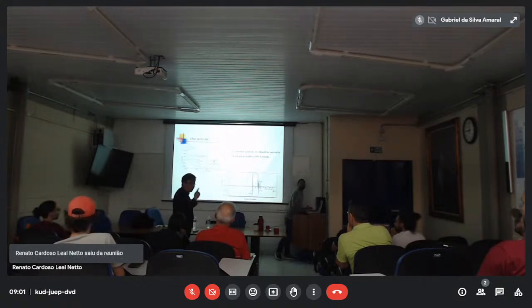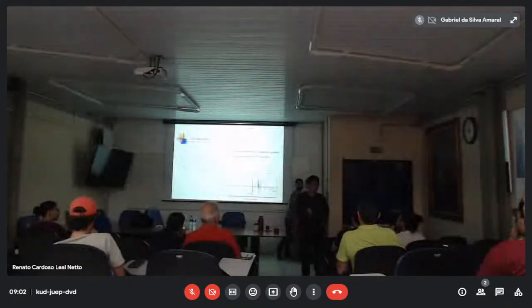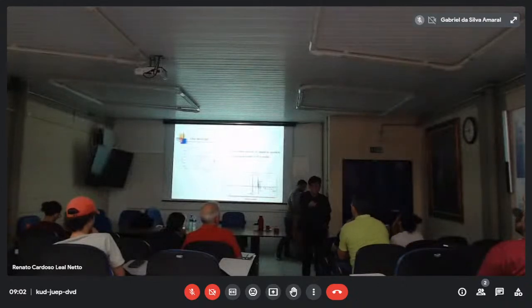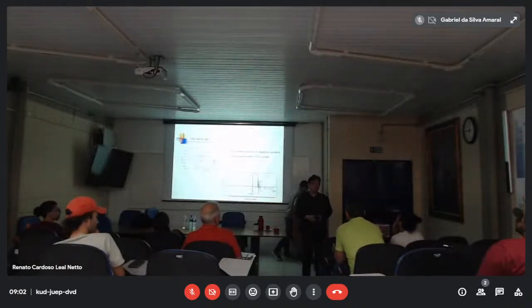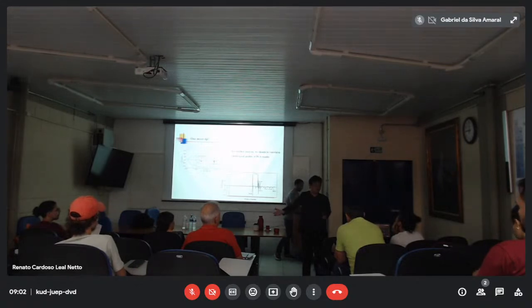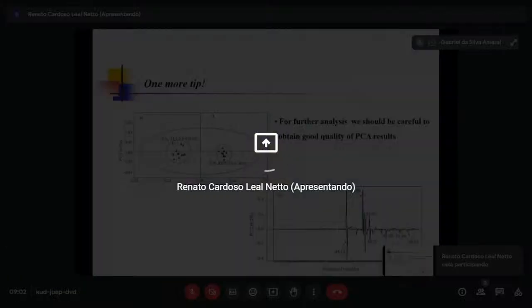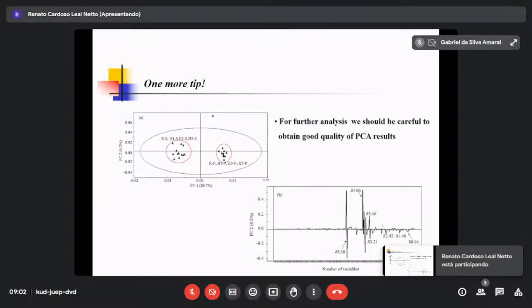Now, of course, I did it very well. I didn't make any mistake. Normalization, calibration, or scaling, no problem. But then it is still too early to delete the data. In that case, you have to go to the supervised methods, after PLS modeling, after OPLS modeling, or independent component analysis. When you change the Y data set, probably those exceptional data are included, like in my case.